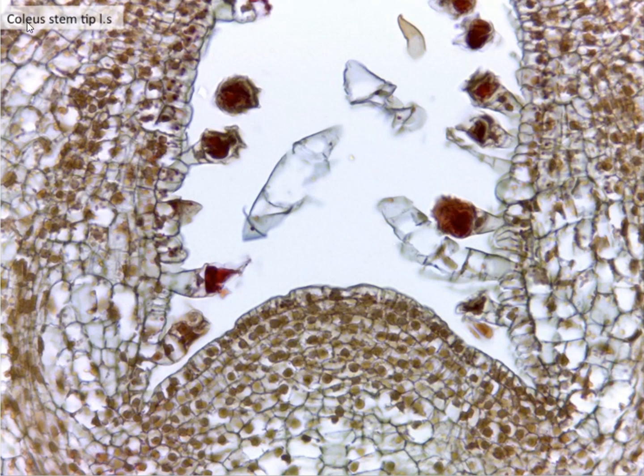Here's that same Coleus stem tip from the previous slide. This time we've zoomed in. This large hill-like structure is a close-up magnification of that shoot apical meristem. Again, that's where auxin is produced to allow the plant to grow vertically as opposed to horizontally, which tends to have more of a bushy-like appearance. In next week's lab, we're going to see in detail what that's like.